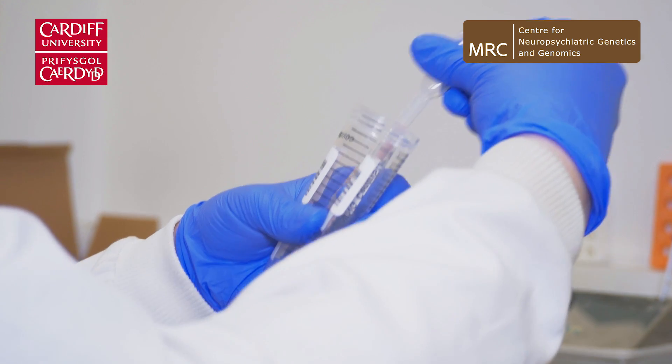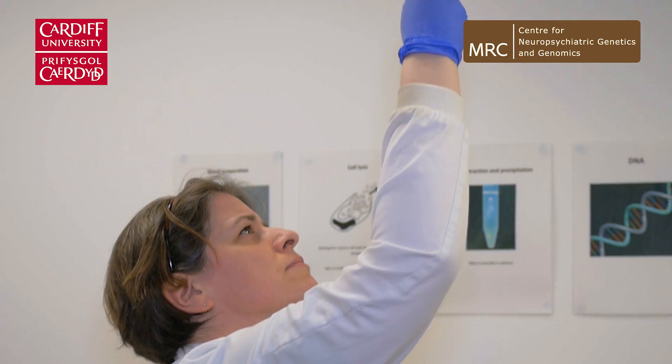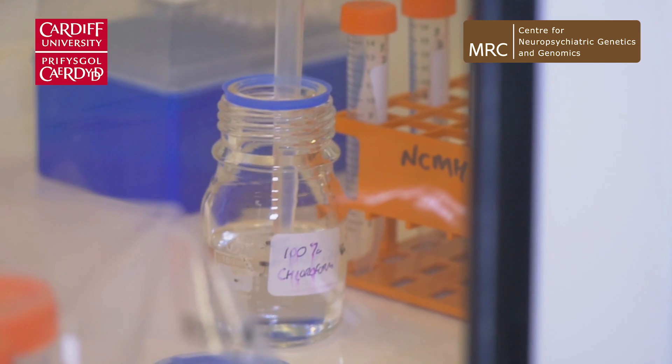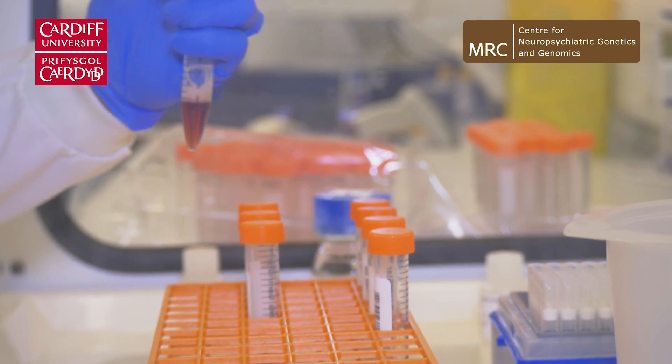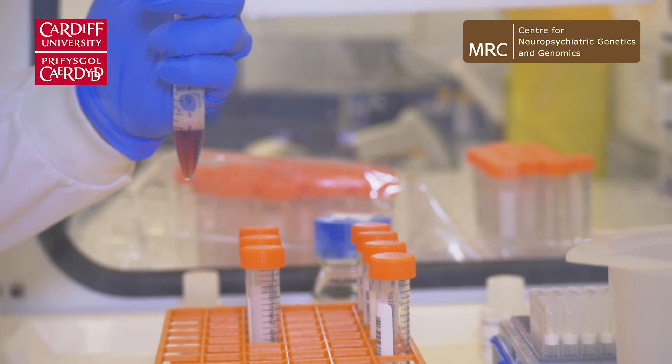DNA is hydrophilic, which means it likes water. If you put it in a hydrophobic environment — an organic solvent like chloroform, which is the one we use — it will do its best to go into the water. Principally what we do is mix up the chloroform and the water layers.